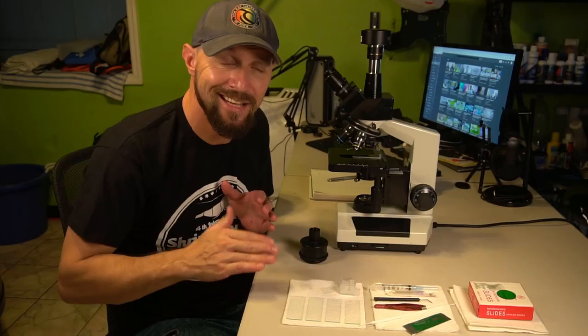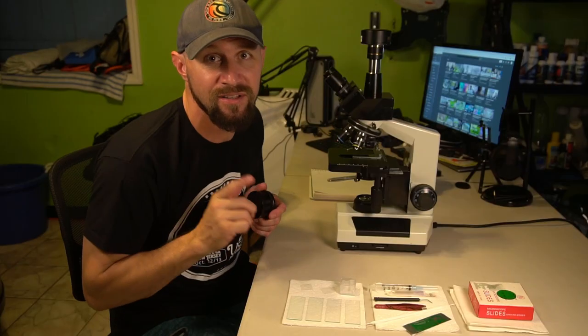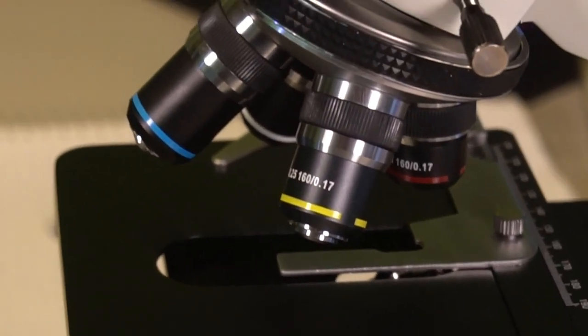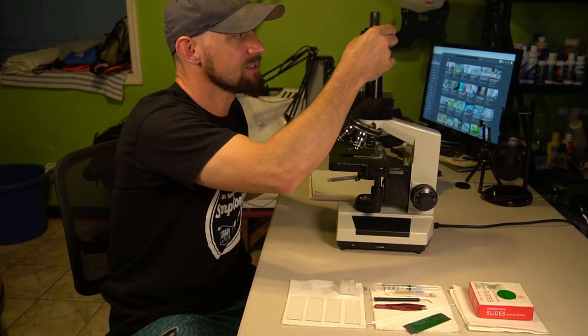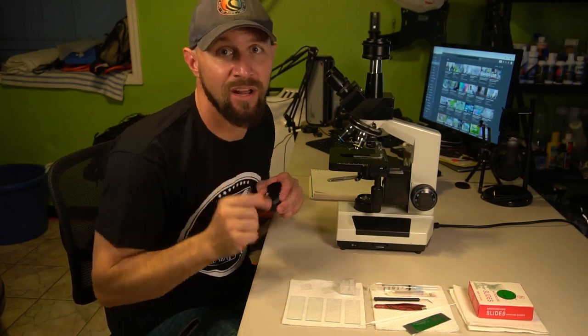I have two regular microscope slides as well. The best thing I have here is this adapter that allows me to use the Sony Alpha a6500 camera I'm filming with — replacing the five megapixel digital camera — so we'll be able to look at everything under the microscope filming with this camera. So let me go ahead and grab the fish and we'll get on this.